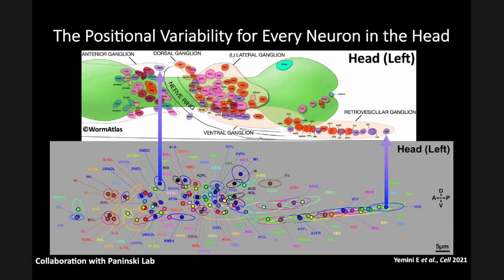If we have 10 worms and we're trying to find a best fit of their best alignment so that as many of these labeled neurons sit on top of each other, we try to find a global alignment across all these that works as best possible. Now, we are allowed to deform the different heads using just an affine transformation, which means we can shrink and make them larger.